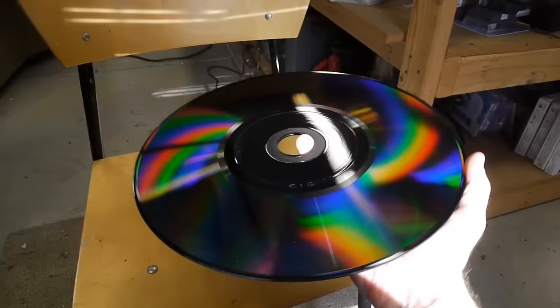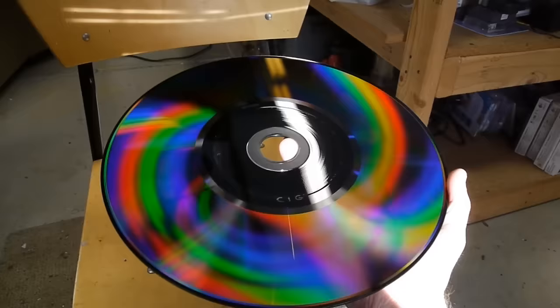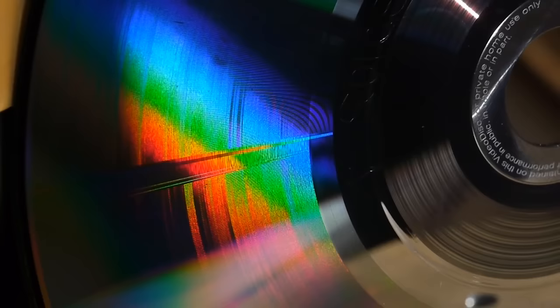It has a track just like audio LPs do, it's just that the information density is so much higher, the track spacing is really tight. So you can actually see the light diffraction pattern in this device.